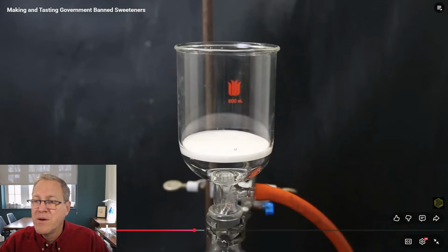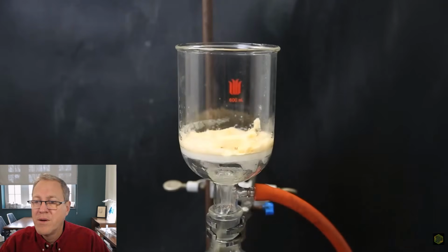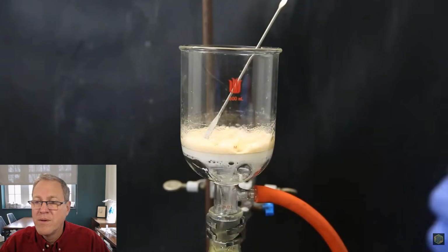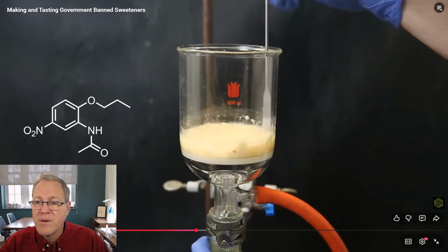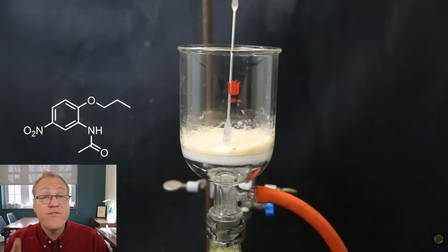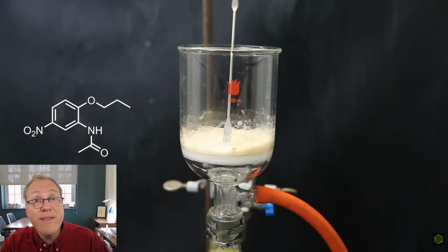And I filter it all again, and add a bunch of water to make sure everything precipitates and to wash it out. Whatever is left on the filter, I immediately use for the next reaction, since it doesn't have to be dry anyway. Okay, so he's not gonna weigh this. He's not gonna worry about drying it.